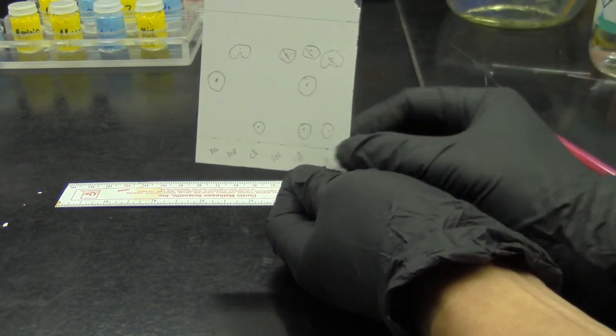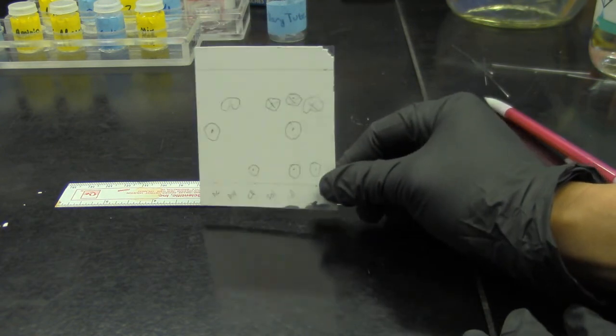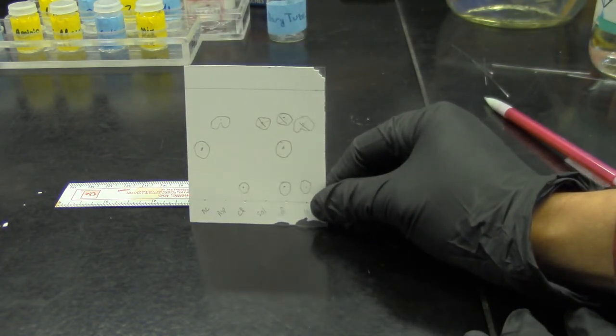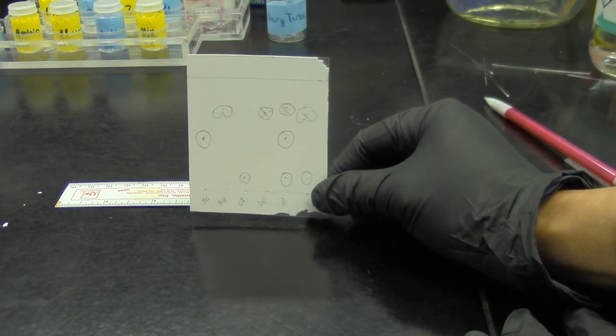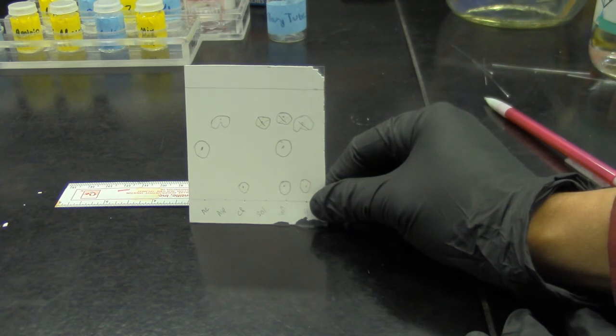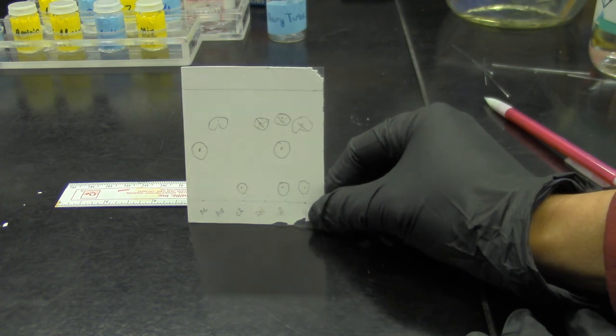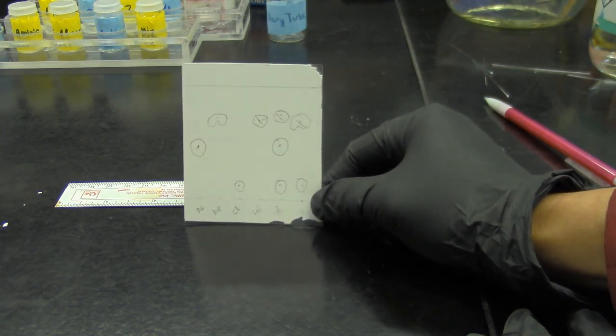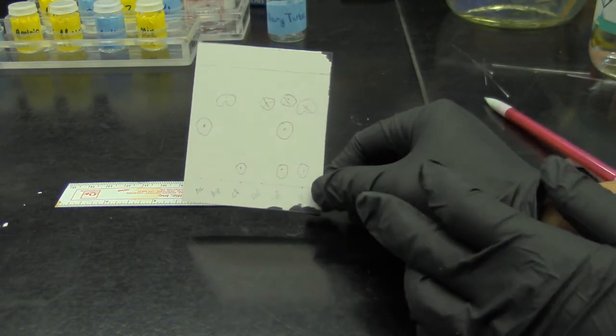I took pictures of all these TLC plates, and I'm going to post them on Canvas. From Canvas you will see all the pictures of both short wavelength and long wavelength, and the measurements for the RF values. You can do the calculation and the measurement. I will post the pictures up there, and from there you can determine the unknown analgesic, right?